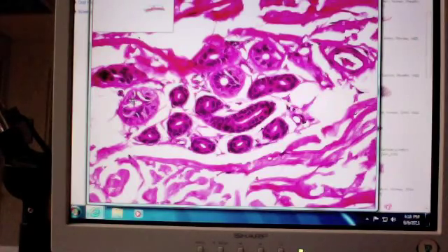because remember that the secretory portion is going to be a single, fairly large cell with secretory product in it, whereas the duct tends to be the same diameter of tube, but now you've got two layers of cells. So the cytoplasm is going to be more dense. They've got two nuclei associated with it instead of a single nucleus. The nuclei are probably going to be more heterochromatic because the duct isn't doing things like making proteins, whereas the secretory portion is, so the nuclei are going to be darker staining as well. So all of those things contribute to the darker characteristic of the duct.